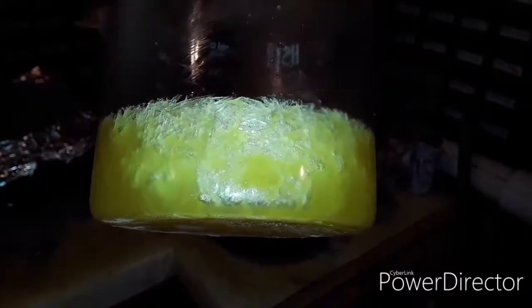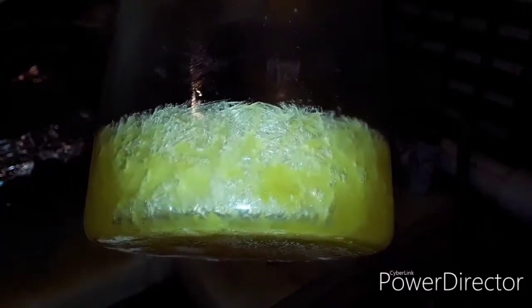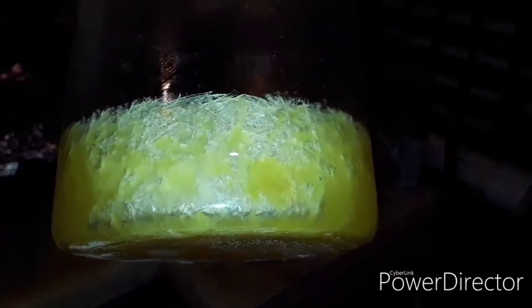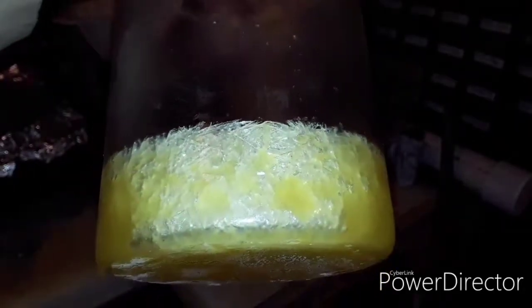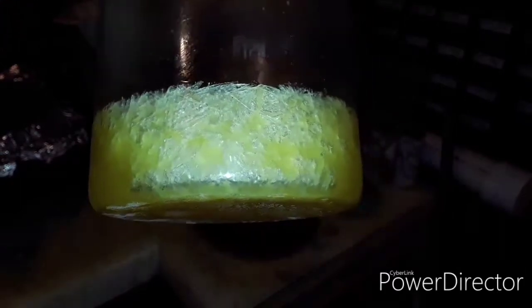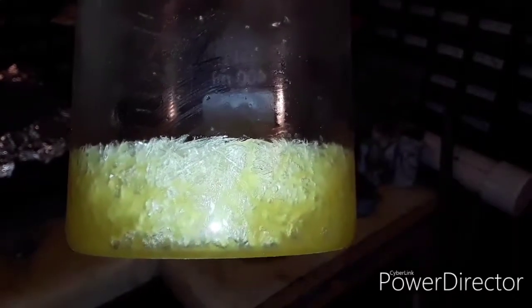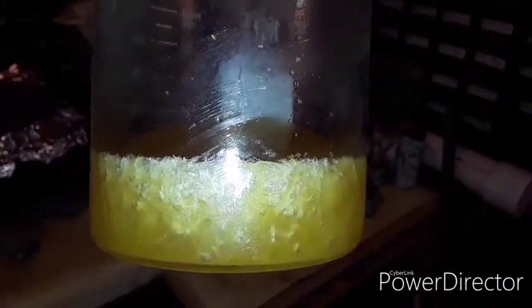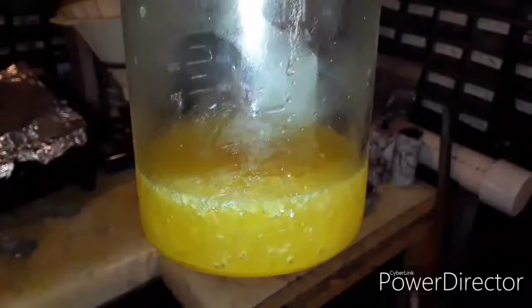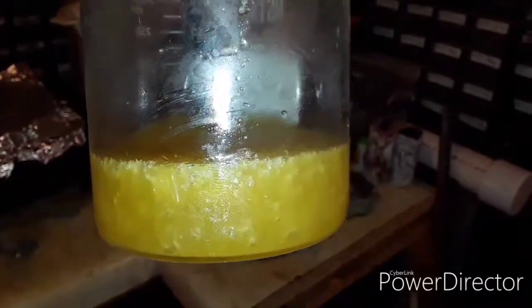Now, the reason why the crystals that you saw earlier have a slight tinge of yellow to them is simply for the fact that all of my vacuum filters, my Buchner filter, and my fritted filters need to be washed at the present time, and when I filtered those last ones that you saw, I was just doing these through gravity filtration. Therefore, there is a little bit of residual liquid stuck in them, which is giving them that slight yellow hue.